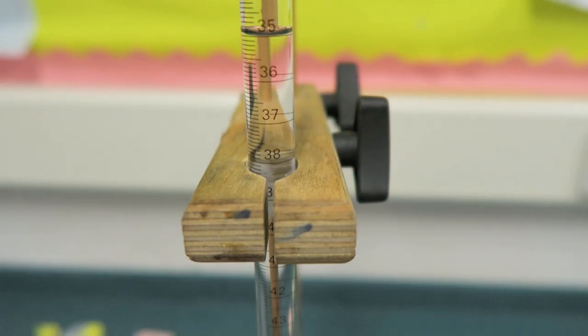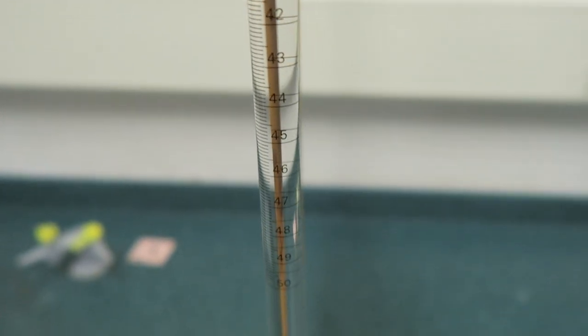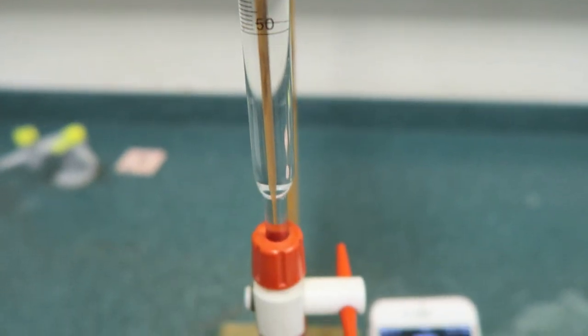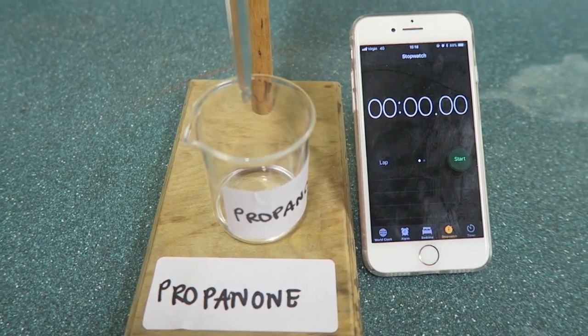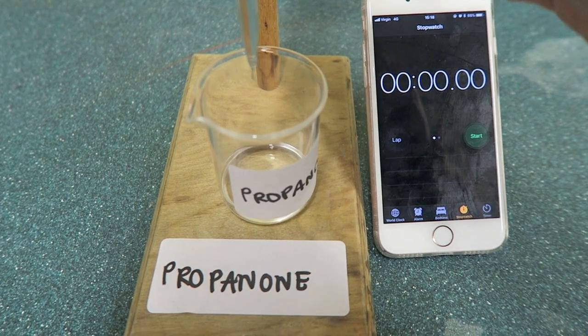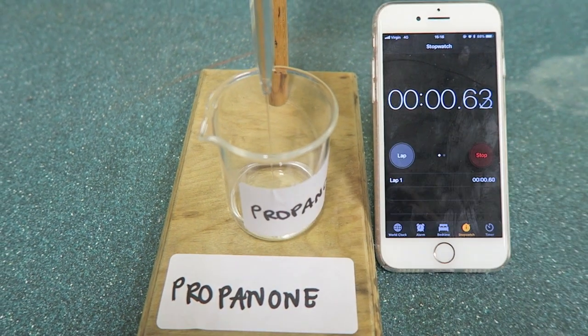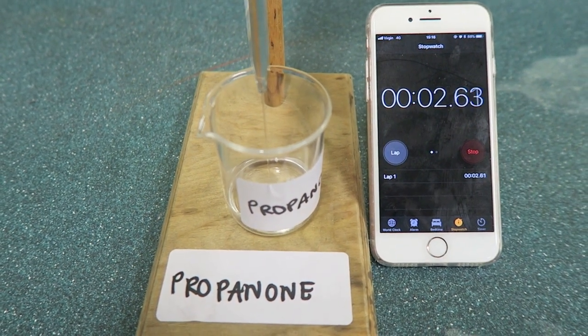In this first experiment a burette was filled to 35 with propanone. I then opened the top of the burette and emptied the burette until it hit the 50 line. I timed how long it took for this to happen. You'll be able to see this in the video.